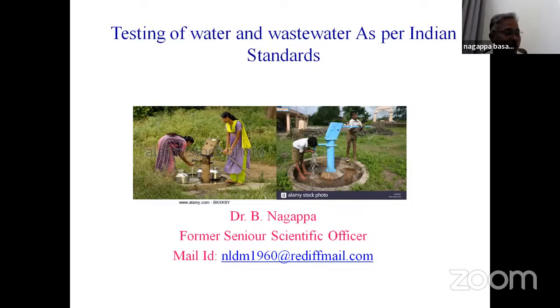There are several methods that have been given. If you take any parameter, nearly 4 to 5 methods are published and accepted. But if a laboratory is accredited with NABL or EPA recognition, we have to follow the highest standard only, as per the NABL guidelines. Apart from these NABL guidelines, a lot of methods are available. We have to standardize the method. Which one is a good method?